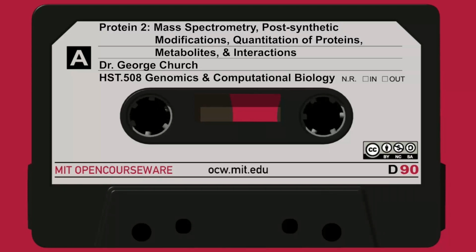So at the beginning of the course, I had one slide talking about how purification was a revolution in many different fields, one of them resulting in recombinant DNA and the Genome Project and so on. Today we're going to talk more about purification from the standpoint of what it tells us about the properties of the molecule itself, as opposed to just purifying for its own sake. How can we go in and data mine and get the maximum value out of purification?